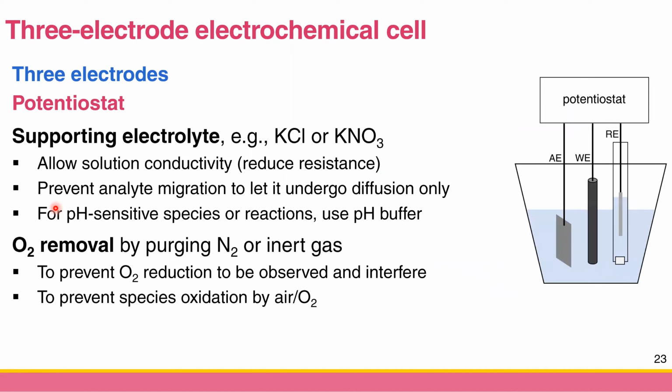Another thing that you have to concern is the cell itself. Now you're going to have a significant amount of current. So you hope that your cell should be at least more conductive than in potentiometry. So to make it conductive, in your solution, you need supporting electrolyte.